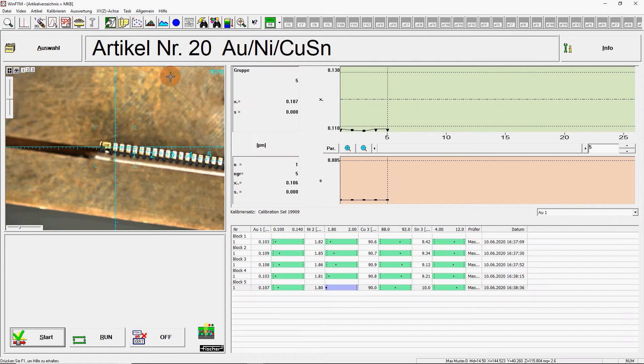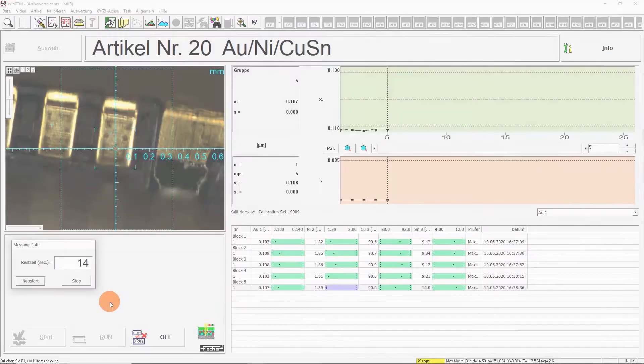You can see in the measurement results, by using the XTV Mu, you can achieve very small standard deviations, even for thin layers and small parts.